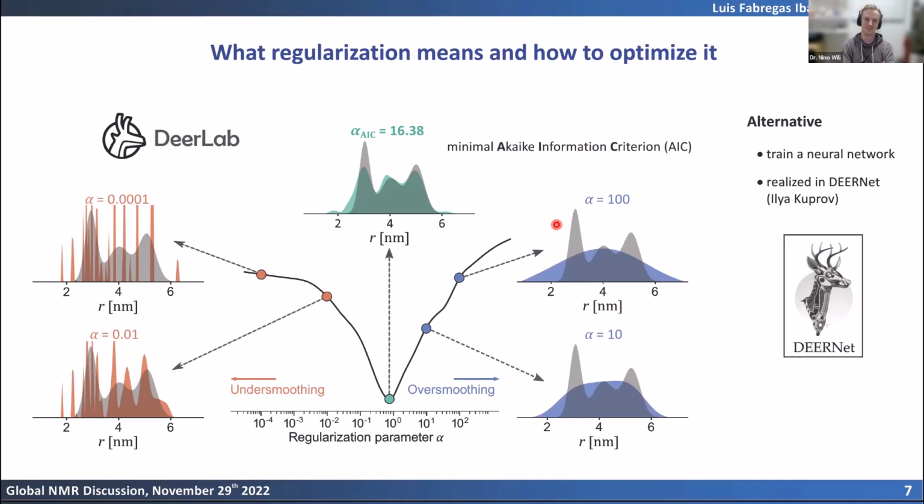Thanks, Gunnar. In fact, the PCA methods, so essentially singular value decomposition, is another way to stabilize these Hadamard unstable problems. The people who tried that a lot is Jack Freed's group in Cornell. What they have discovered is that it has a lot of fiddle factors, which are just a different instance of the fiddle factor, that's the regularization parameter.